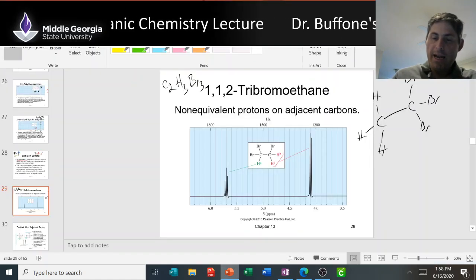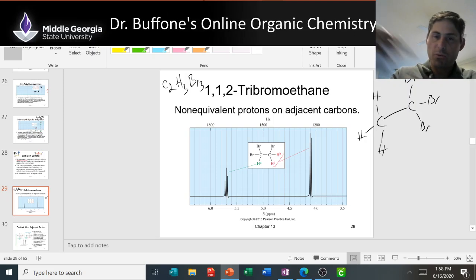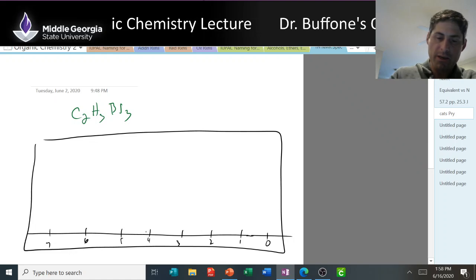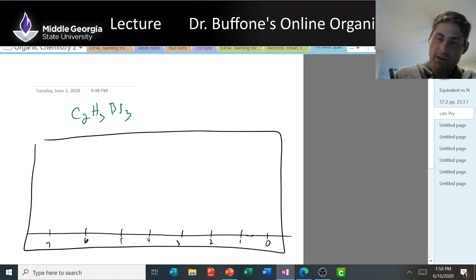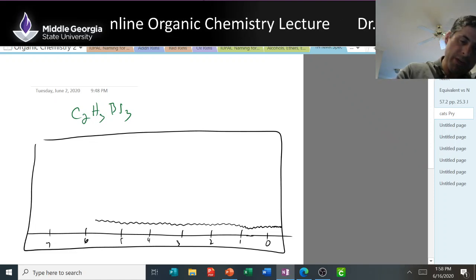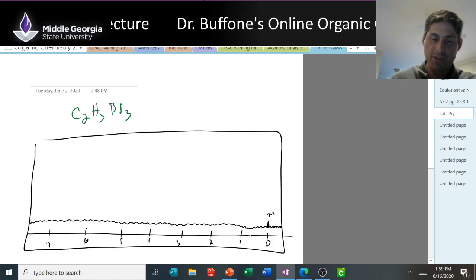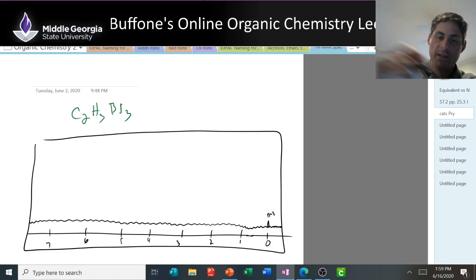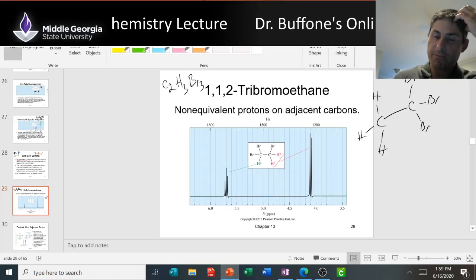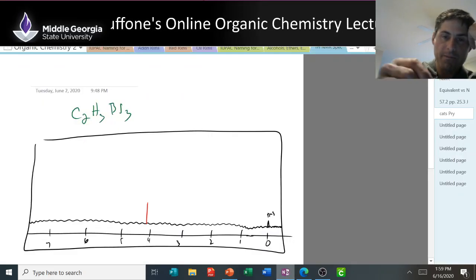All right, so we would actually see a peak at 4.1, that's red right now. So we would have NMR signals jumping out of the baseline. If there was nothing here, just TMS, this is what we would see. If we put this molecule in here, we get a signal at 4.1. I'm not going to split it yet, and we get another one in green at 5.7. Okay?